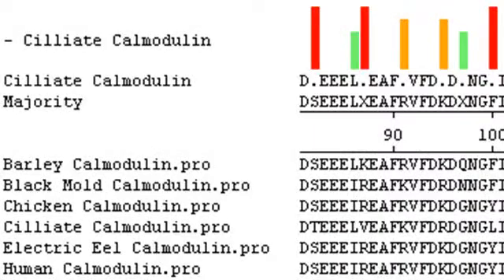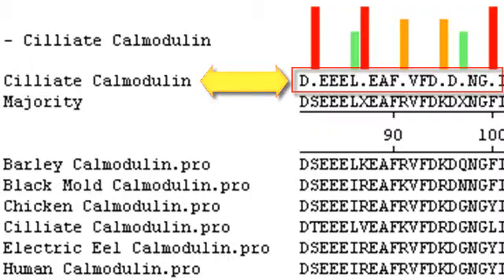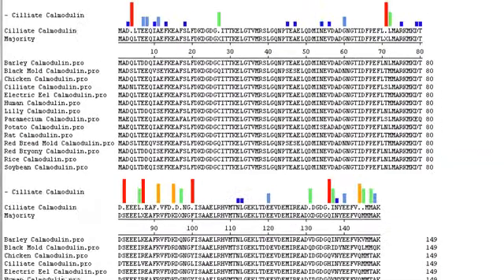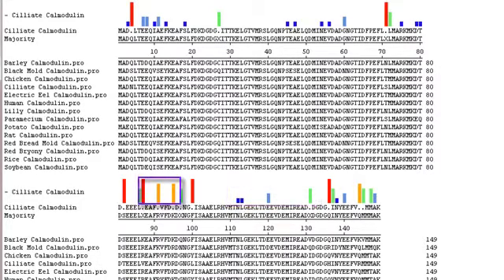Looking at the sequence next to ciliate calmodulin, periods show the places where the majority of species do not match the residue found in ciliate calmodulin. The histogram shows the amount of disagreement, with cool blue and green tones representing less disagreement, and warm orange and red tones representing more disagreement.